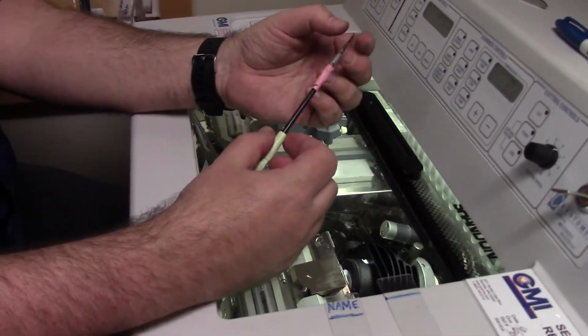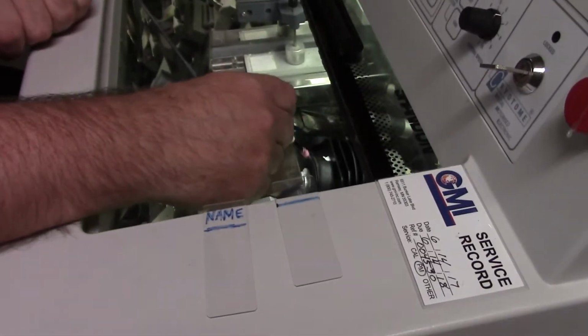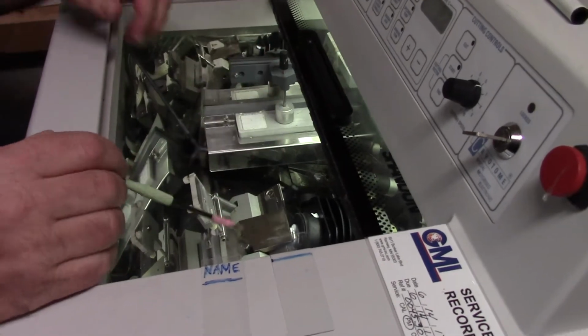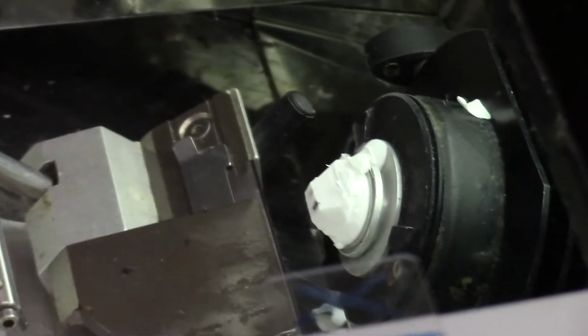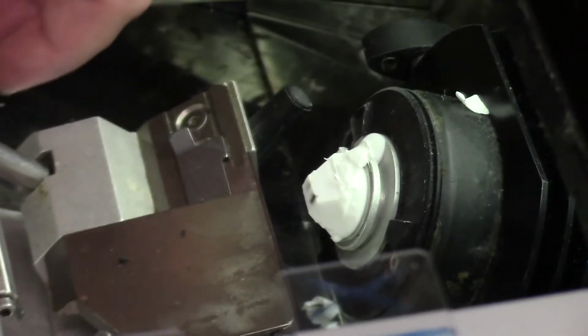My block's starting to get a little dirty, so I'm going to leave the chuck below the blade, and I'm going to grab a paintbrush. Yes, a very dirty, rusty old paintbrush. This job of the paintbrush is to just push away those snowflakes so that I have a clean working surface. So now what I'm going to do, oops, I got another snowflake there. The blade does not cut on the way up, but there was a snowflake stuck on the top of the blade, so as it passed, it got stuck on the bottom of the blade.